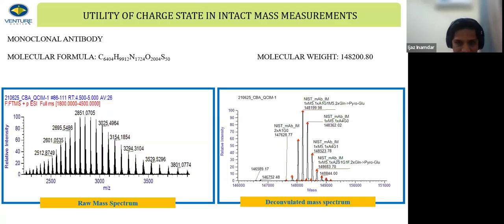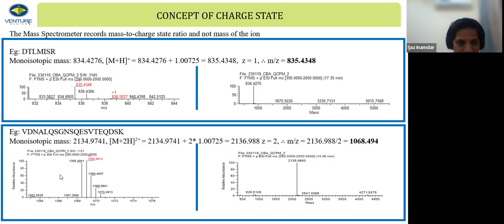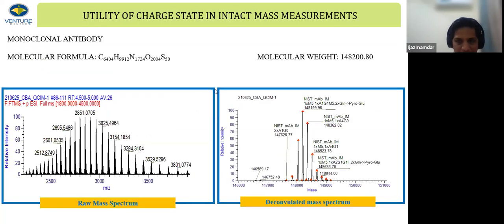And this is the last but one slide of the presentation. Now we have talked about small molecules, with very small masses, 1068 or something like that. Let's talk about a protein. If you remember my second slide, I gave you the structure of a protein that has a mass of approximately 145 kilodaltons.